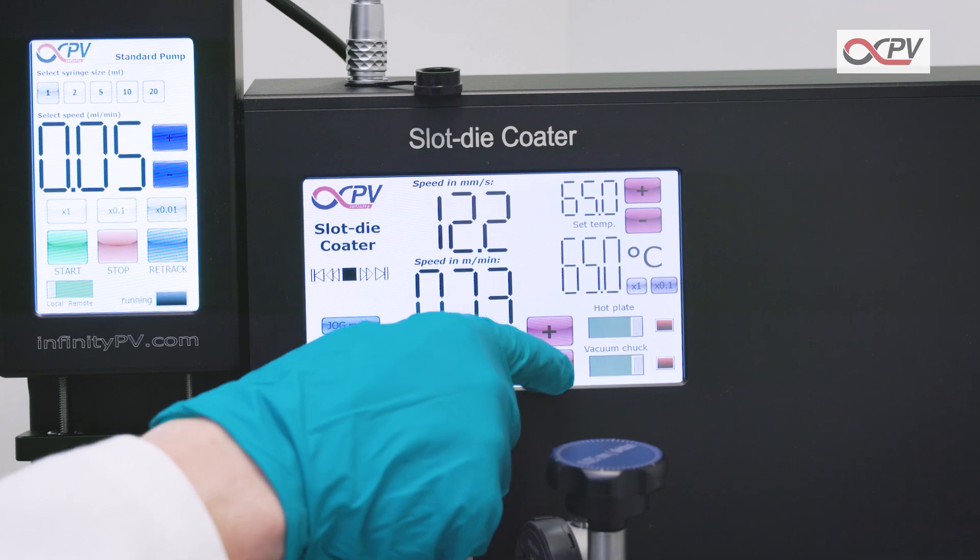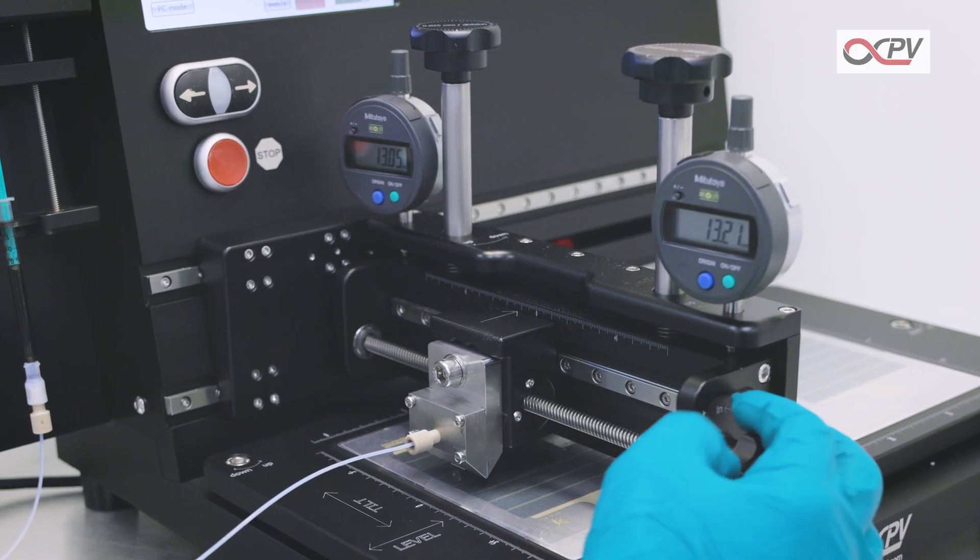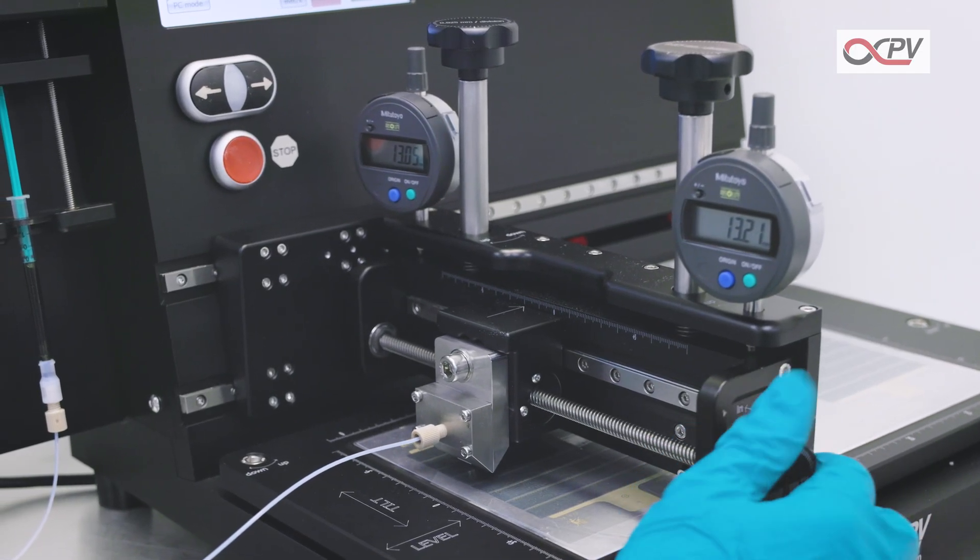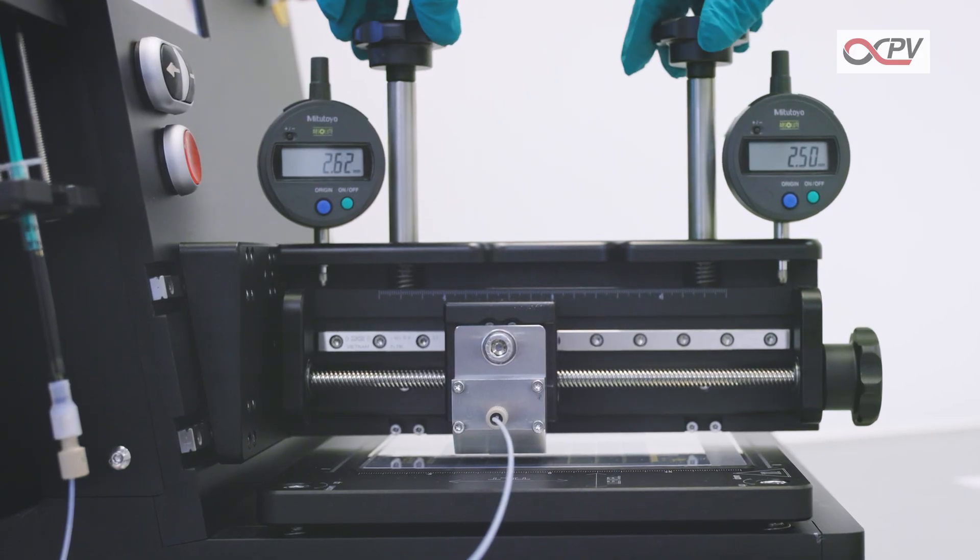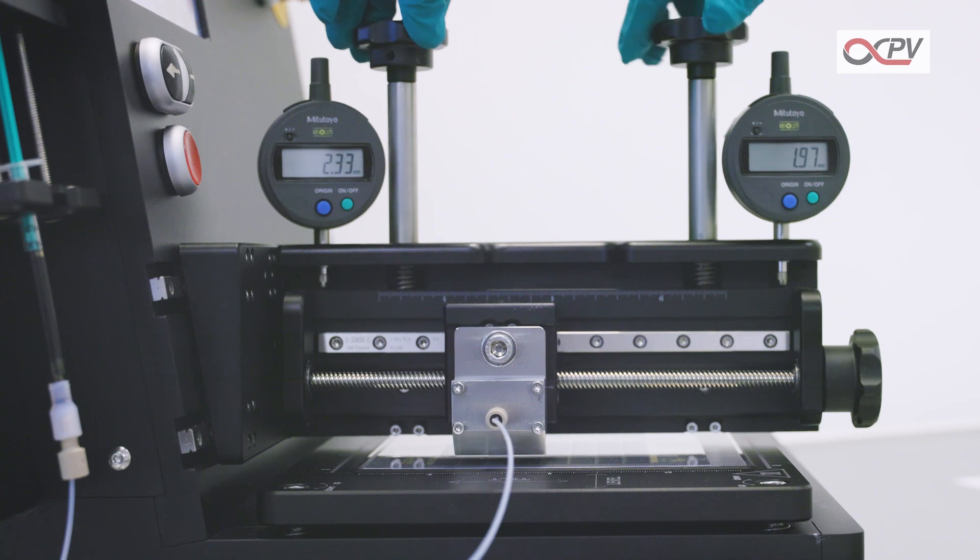Set the desired coating speed. Adjust the cross-web position of the Slot Dye Head to align with the substrate pattern. Then set the gap between the Slot Dye Head and substrate to achieve the correct coating gap.